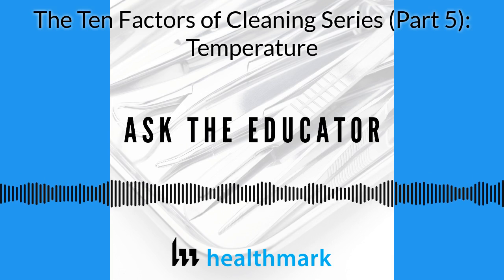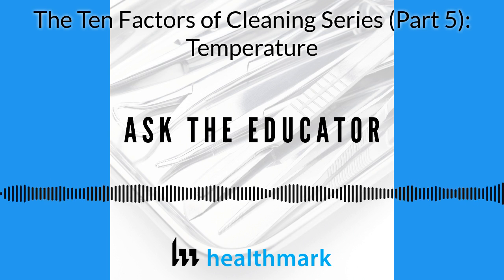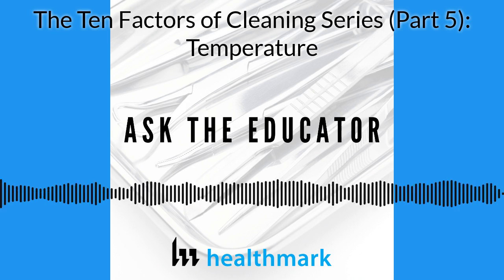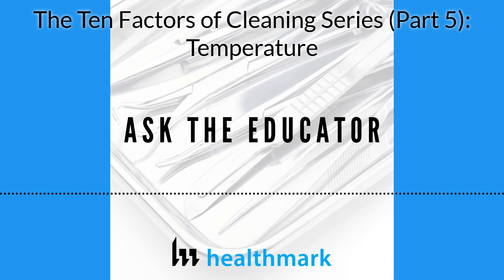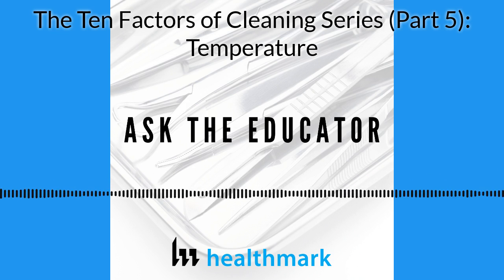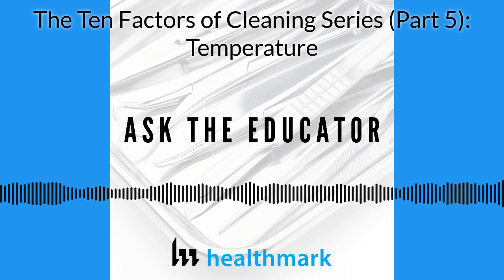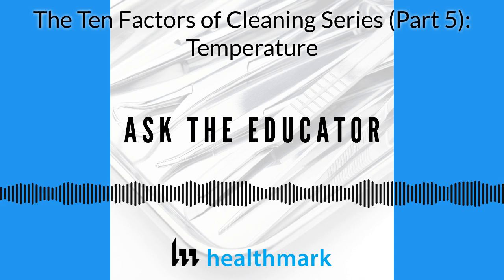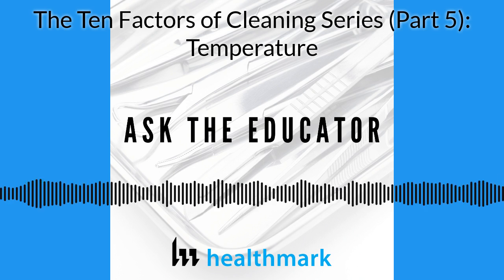So if you're using cleaning chemistry A and its optimal temperature is 150, but you go and use somebody else's, theirs could be 155 or 145 or even 160. So if you want to use that cleaning solution to its maximum, you should be able to work with your automated washer company to help set those temperatures in that process. And that, again, is very important. Some people use enzymes and they are running it at high temperature and then it doesn't work. So knowing that temperature is very, very important.